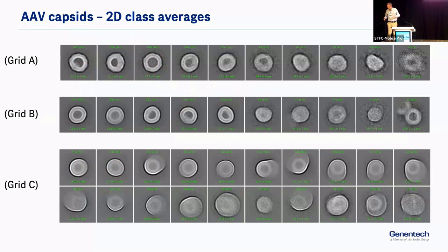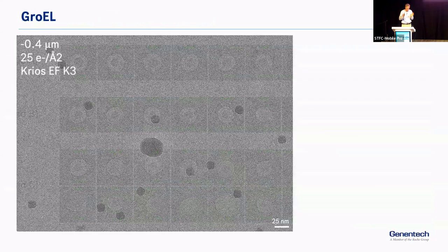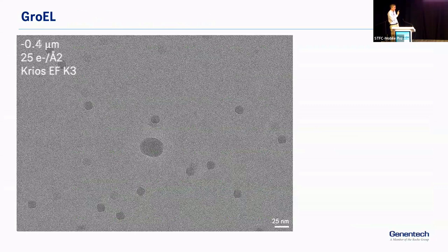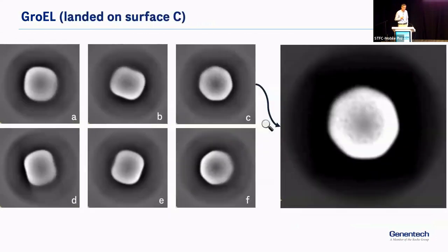from the defocus. CTF models that we use for normal single particle processing assume very low amplitude contrast, which isn't the case here. So it's difficult to get really nice CTF correction with these images. But long story short, we can't average these to anything coherent. We think that there's some kind of denaturation that's happening, even though we have kept them hydrated in some respects. This is going back to CryoEM, closer to focus again, pretty clean backgrounds. You can sort of see different views. But again, when we average them, it really doesn't work the way it should.